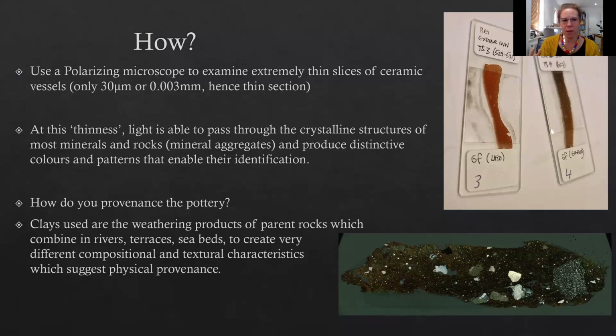So you look at these distinctive elements, and how do you actually provenance this pottery? What do these minerals mean? How do we get there? Very simply, it's from the clay and the parent rocks as well, which perhaps use temper.